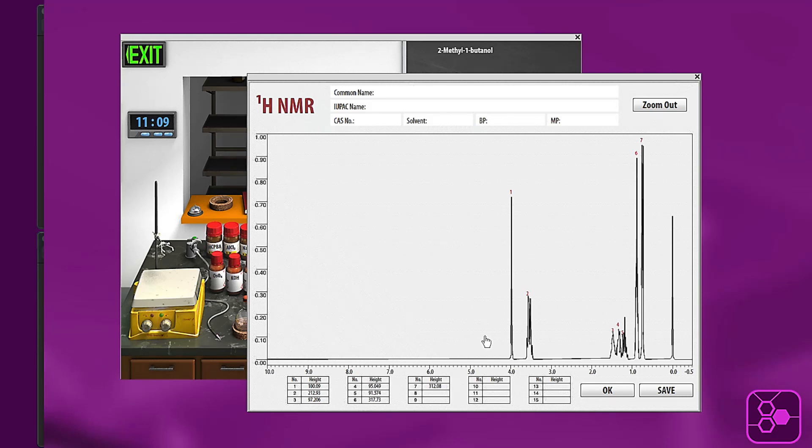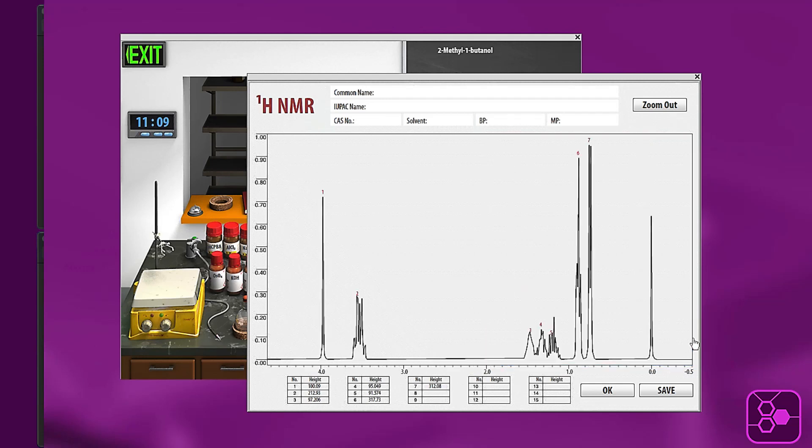You can also click and drag on the spectrum to zoom in. So in this case I'm going to zoom in below 5 ppm because there's nothing above that of interest. And it will give you a clear view of the peaks so that you can see splittings and so forth.